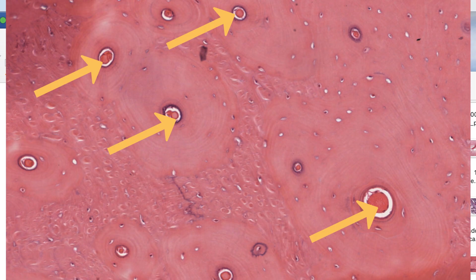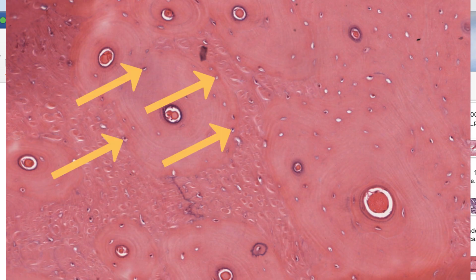The tissue within the canals is generally poorly preserved. However, each will contain a tiny arteriole and a venule and will be lined by flattened osteoblasts. The many smaller blank spaces around the Haversian canals are lacunae for osteocytes. In most cases, the cells themselves were washed out when the section was prepared.